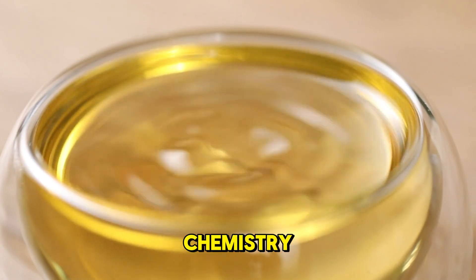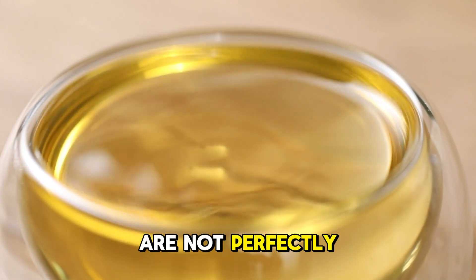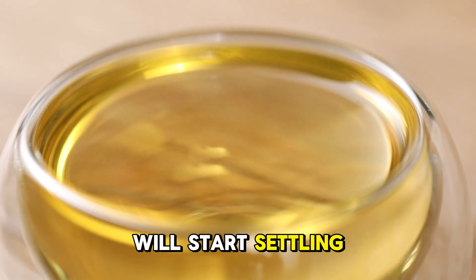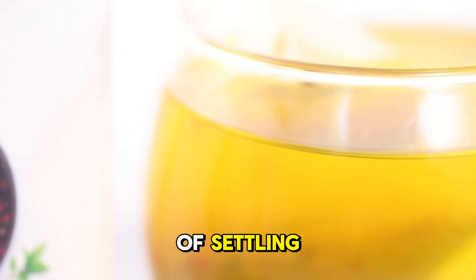Without getting too much into chemistry, cannabinoids mostly dissolve into oils but are not perfectly soluble. In other words, the cannabinoids will start settling over time, and we've found that even just after a couple of hours there can be a measurable amount of settling.